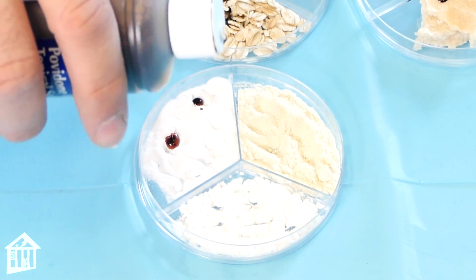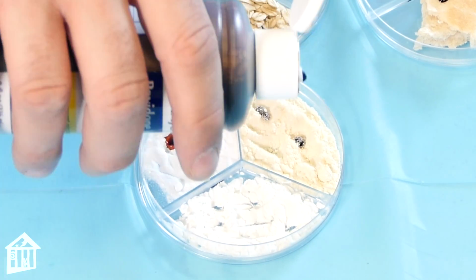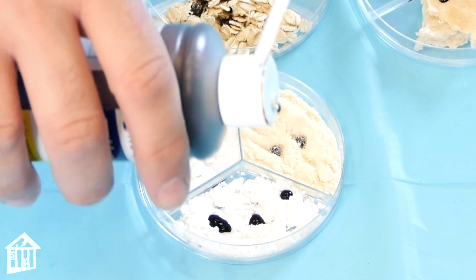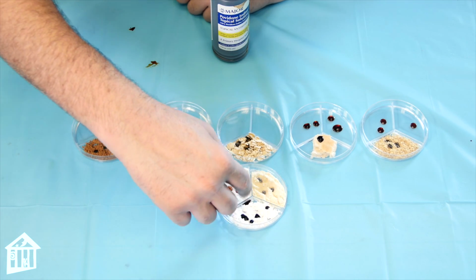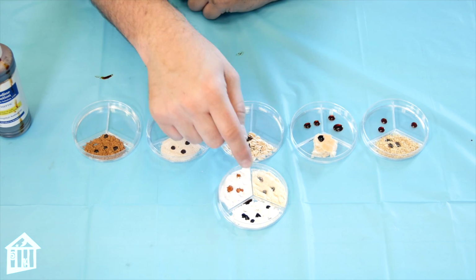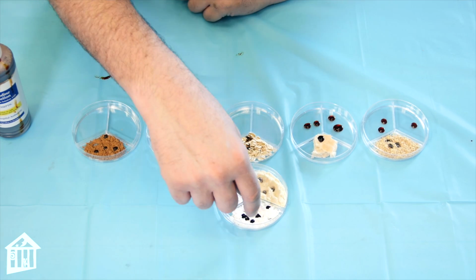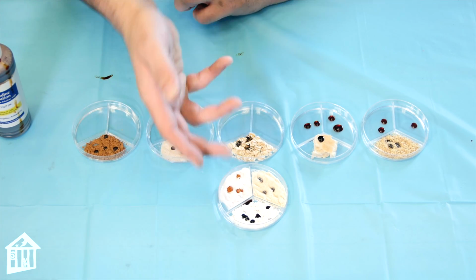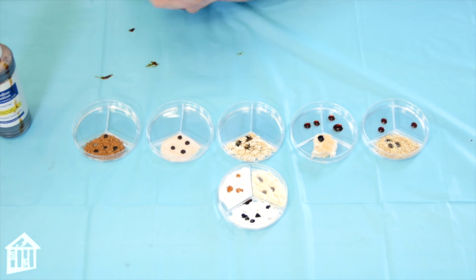Now look at that. That one is staying really like the way. Let's see this one. Ooh, that one changed a little bit. And then let's go ahead and try this one. That one is changing quite a bit. You can see it turns really bluish black, that one. So we know that there's trace amounts of starch possibly in this, which is powdered milk. There's no starch. Look, you can see it's really brown in this, which is baking soda. And there is tons of starch in this because this is cornstarch. So if it didn't turn that color, it would be a mystery to me because it is just nothing but the starch of corn. Okay, that's how you do it.